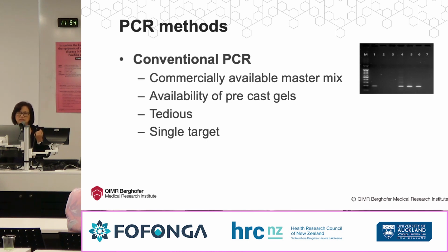Well, recently, this technique can be tedious because you need to prepare gels, especially like the survey they've done about 400 samples. So you won't do this anymore because it's really tedious, and you can also only amplify a single target with this method. But there is also now the availability of master mixes that you don't need to put all those components that I have mentioned in the earlier slide. You only have to add your DNA and your primers. And also, you don't need to pour gels. You know, you can buy now precast gels, and you can have a look.